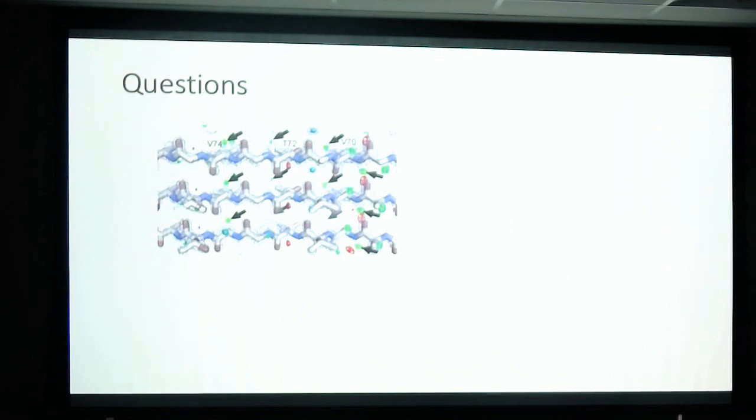I don't think there are many people doing 2D crystals right now, because single particles work so well. The reason 2D crystals worked really well is that the imaging and processing techniques weren't nearly as advanced for single particles. By having a 2D crystal, you had the advantage of having everything just about ordered. And then you still had to do the unbending, fixing the crystal deformations in 2D.